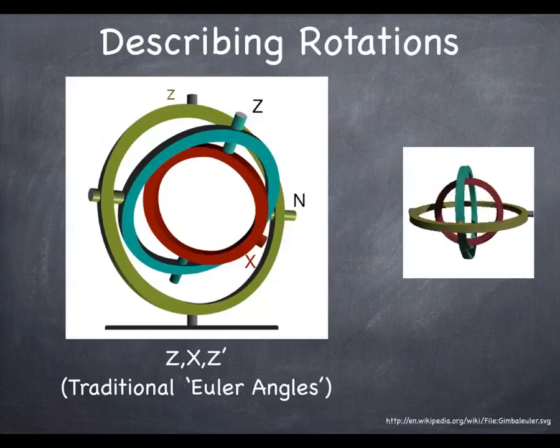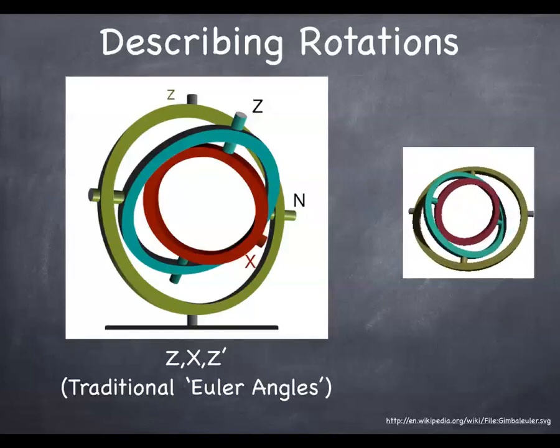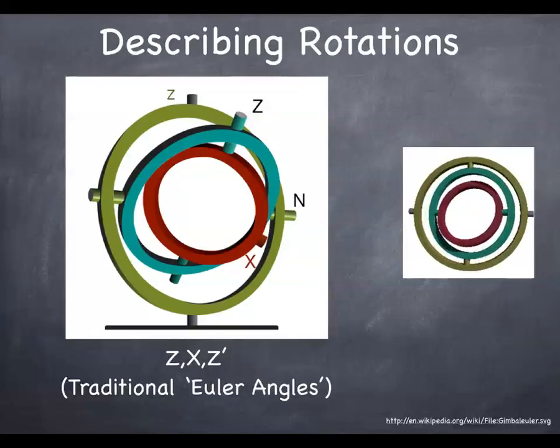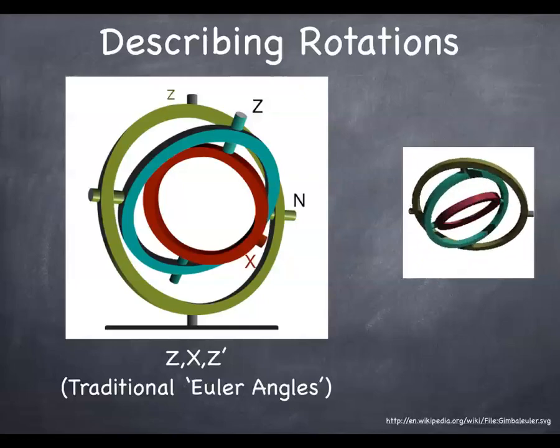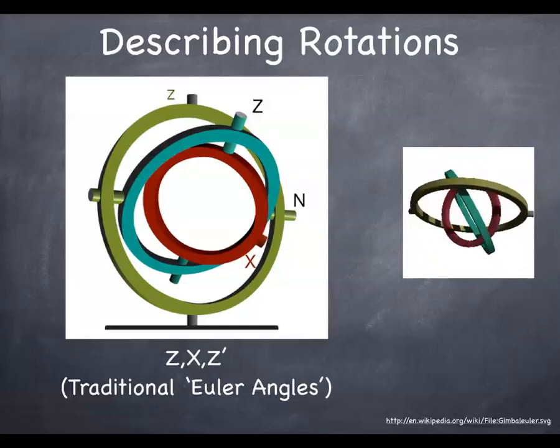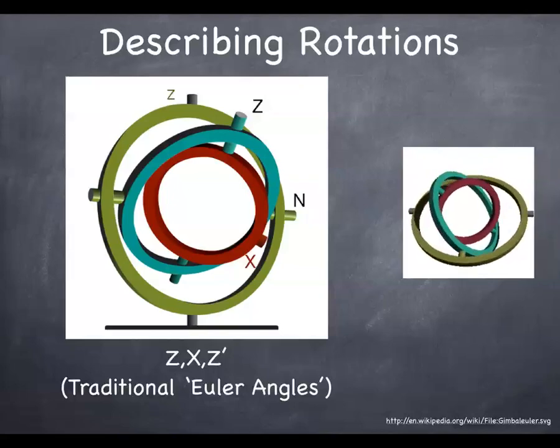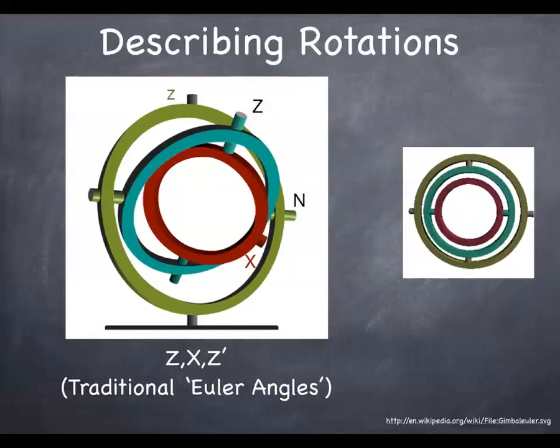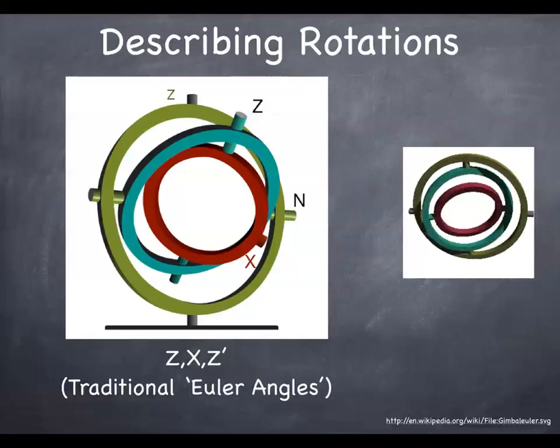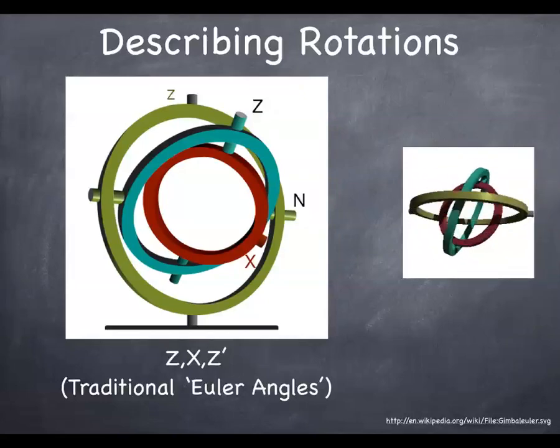Okay, rotations. So you can do rotations in 2 dimensions, or you can do rotations in 3 dimensions. And since we deal with 3-dimensional data, we have to consider 3-dimensional rotations. Any 3-dimensional rotation can be specified in terms of 3 numbers. There are a lot of different ways of specifying the 3 numbers, but you need 3 numbers to do it. No more than 3 and no fewer than 3. It takes exactly 3 numbers to describe an arbitrary rotation in 3 dimensions.